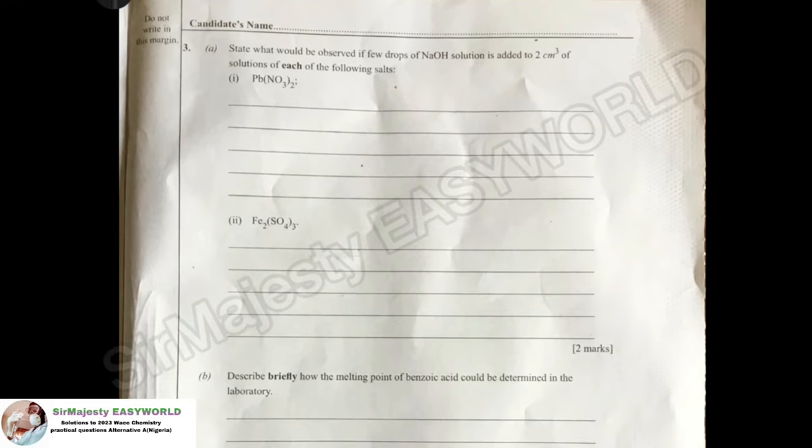just know there are 2 ions here, which are lead 2 ion and trioxonitrate 5 ion. We don't use sodium hydroxide to test for trioxonitrate 5 ion. Rather, we use sodium hydroxide to test for lead. So they are just asking you the test for lead. So what you should write here, they say what will be observed. You say there will be what?